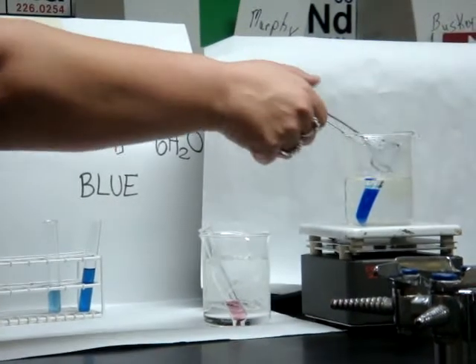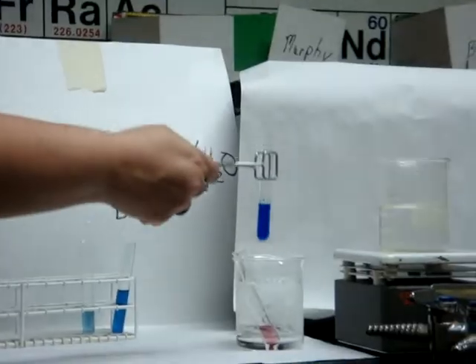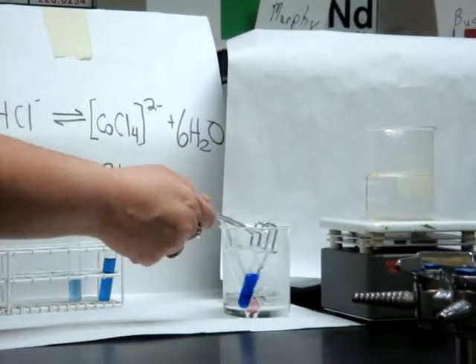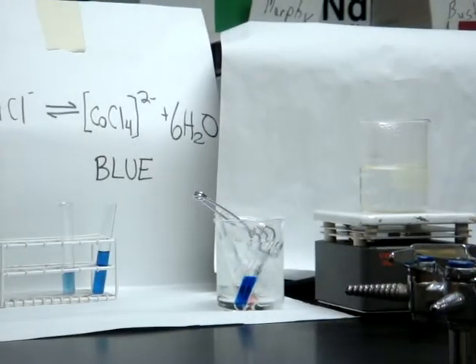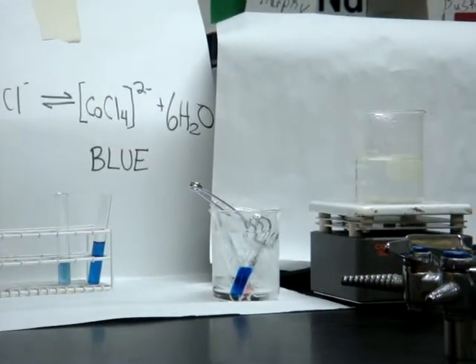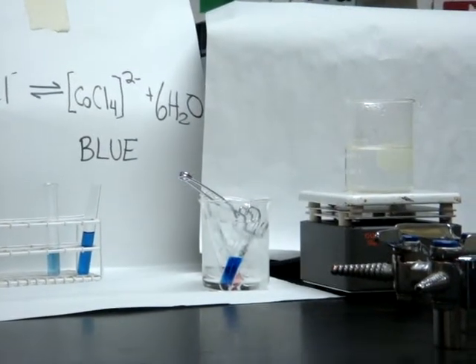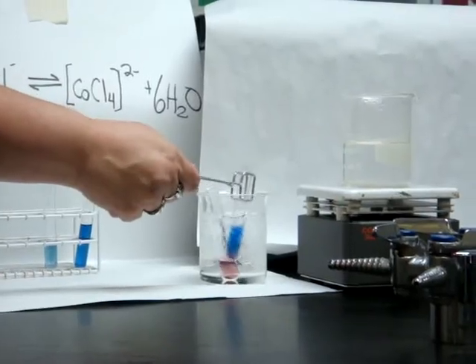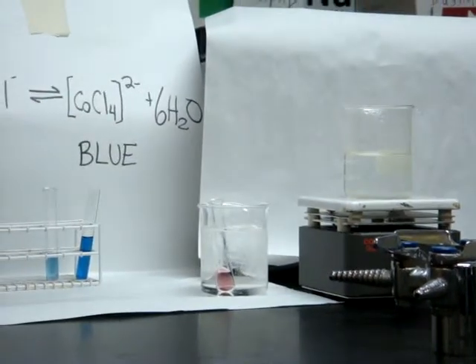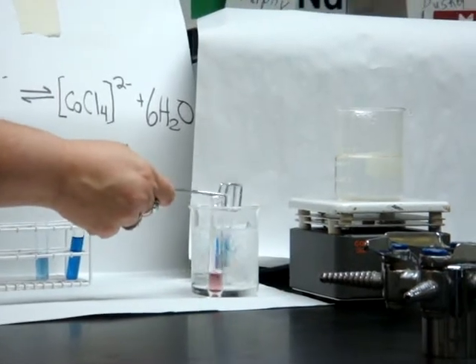Now, the cool thing about this is I can take this really, really dark blue stuff and put it in the ice bath. Let's see what it does. It's happening. It's starting to change pink. It's still all blue? No, it's changing.